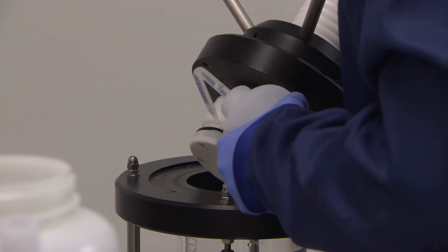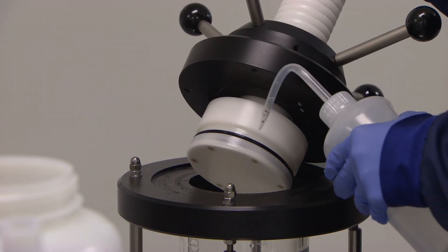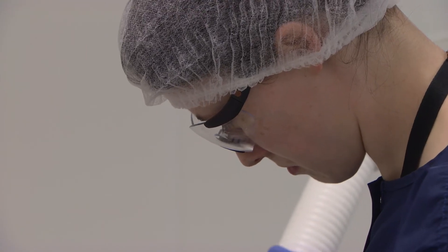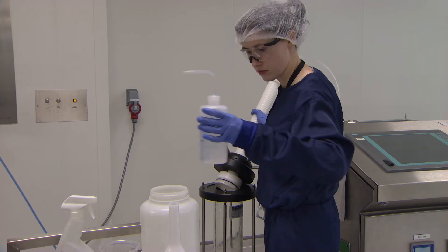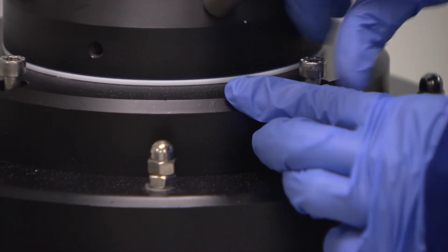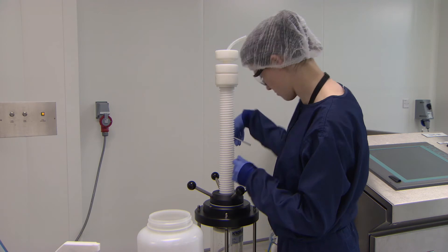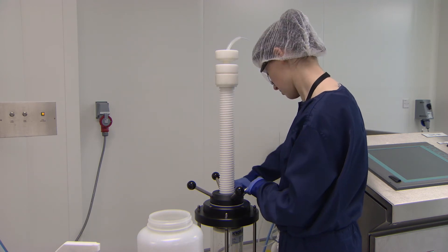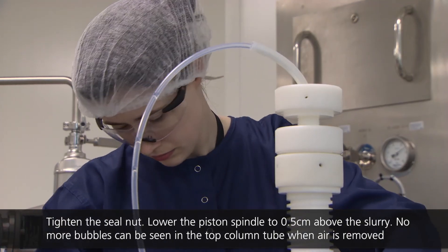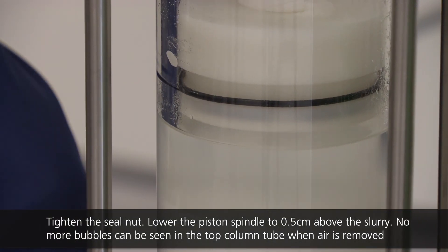After the chromatography resin has been poured into the column, the piston may be re-installed. Before placing the piston into the column, the piston seal is lubricated with buffer to prevent damage to the seal during installation. The operator lowers the piston to a defined distance above the slurry, as per the protocol. The piston seal nut is then tightened.